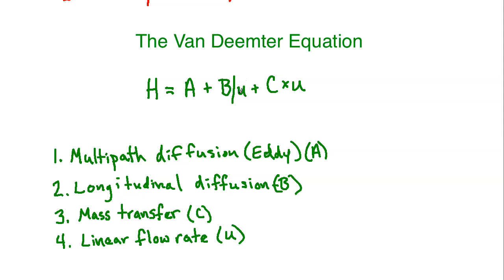And that makes sense because what happens is if I keep a very low flow rate, it's going to take a long time to flow or push material through the column, right? If I'm only pushing 1 milliliter a minute through, it may take a whole lot of time until I get to this analyte. Whereas let's say that I'm setting it at 3 milliliters, 4 milliliters per minute. Well, then I'm having a bit of a quicker movement over the stationary phase with the mobile phase.